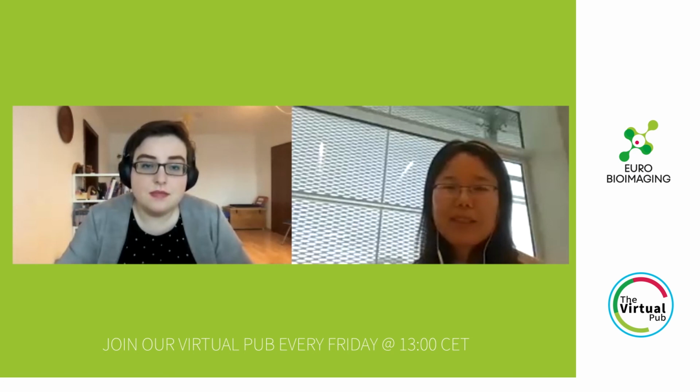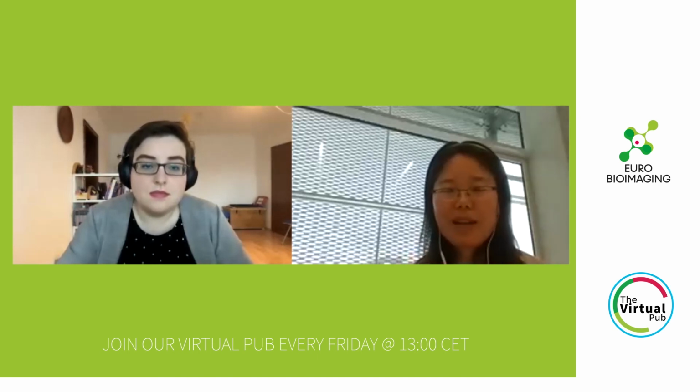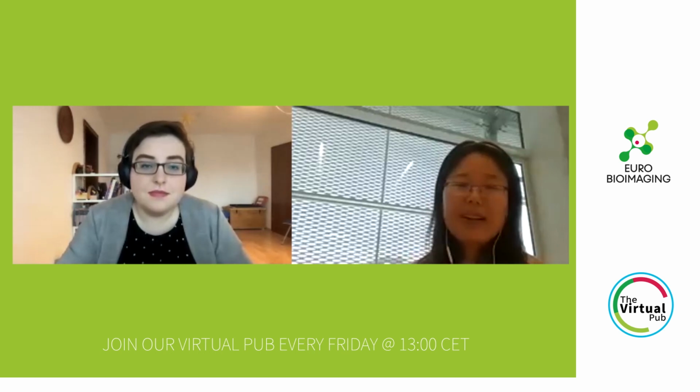For our lab right now, we still think that it's not some kind of vascular system. We identified some immune cells inside these connections, and right now we still don't know what they really are. This is one of the bigger projects where our PhD students and postdocs are working together to identify the nature of these things, and also identify the functions. But based on our knowledge right now, we cannot say correctly what they are.